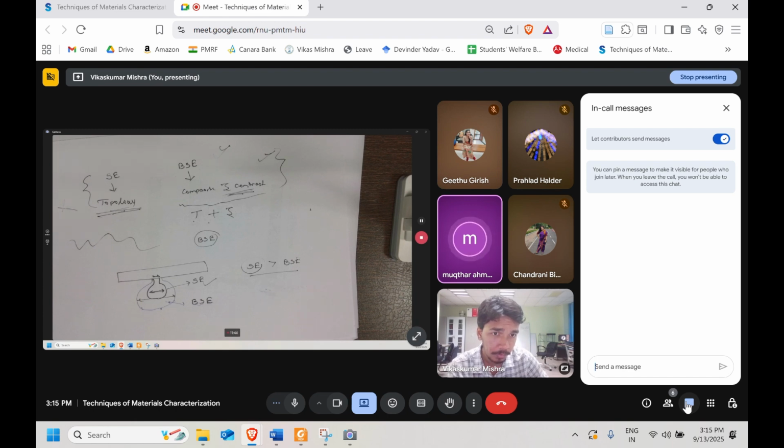Because it may completely differ if I am applying my own ideas to tilt, or I need to do trial and error in stereo microscopic SEM, because we are getting some 3D differential depth perception of the surface features. One is directly on the flat, one is a little tilt. I don't know how to measure that little.